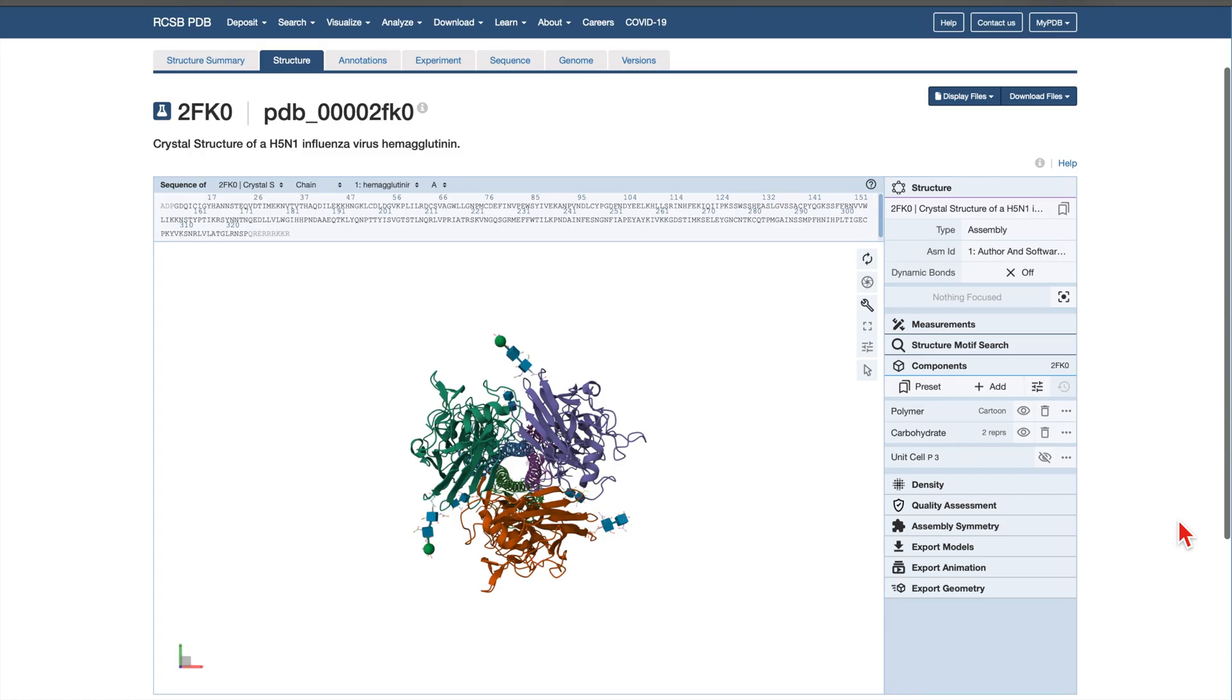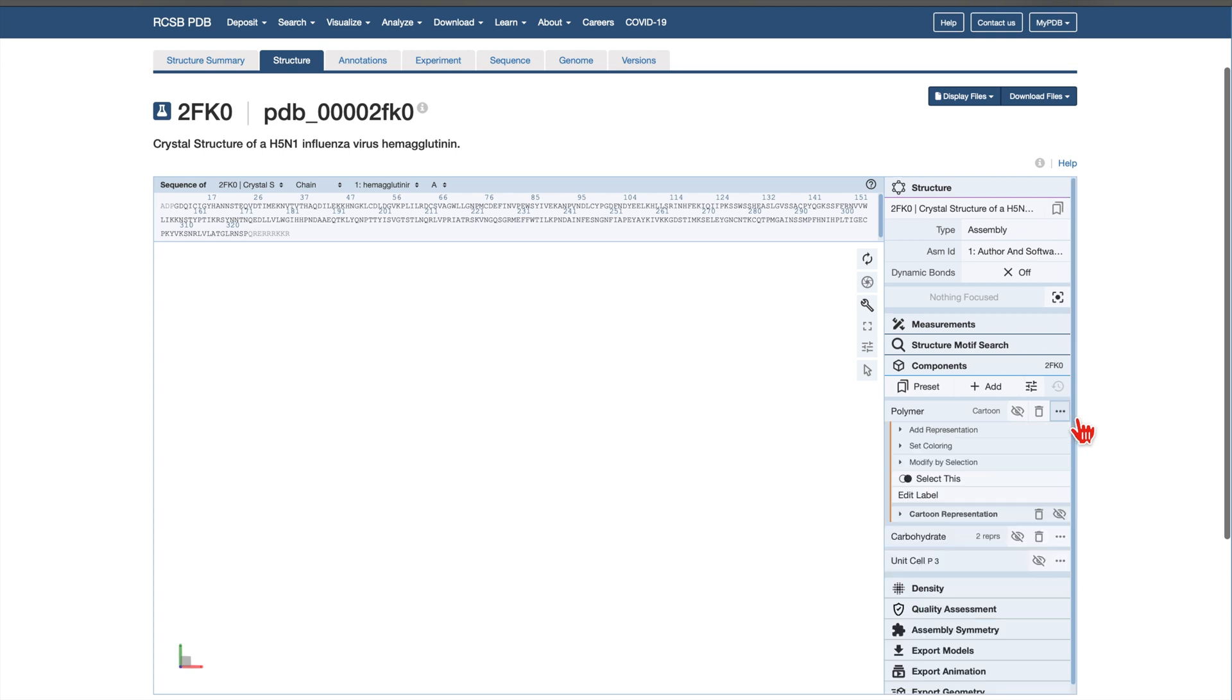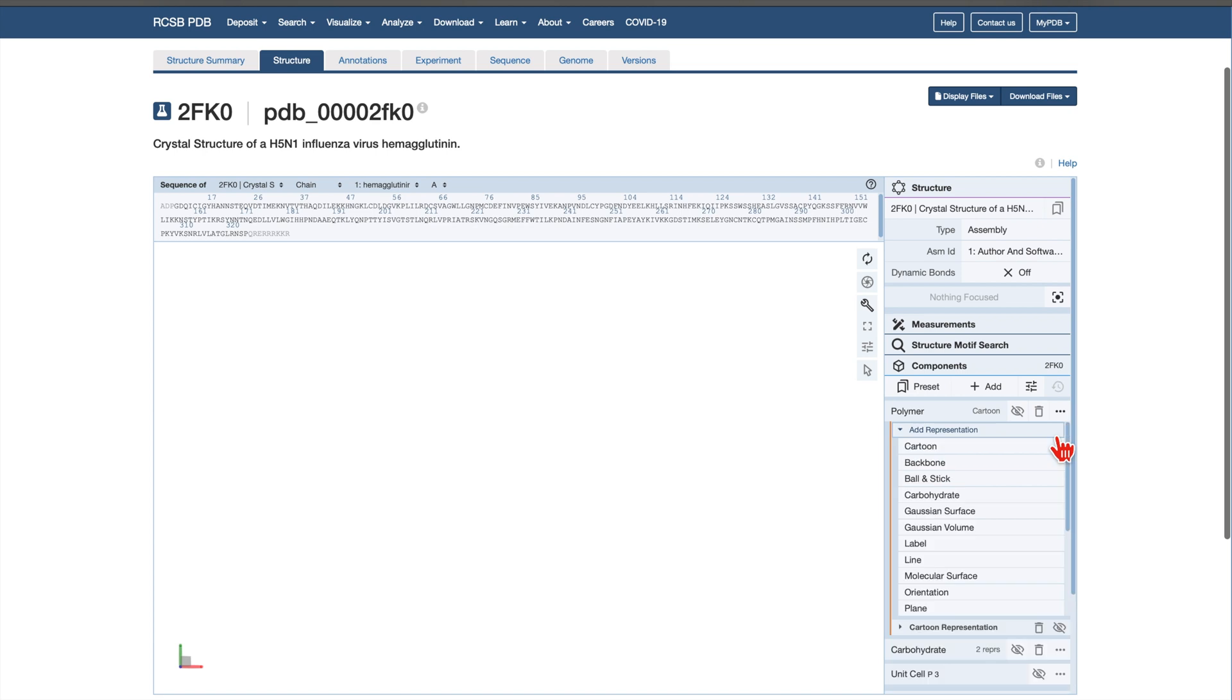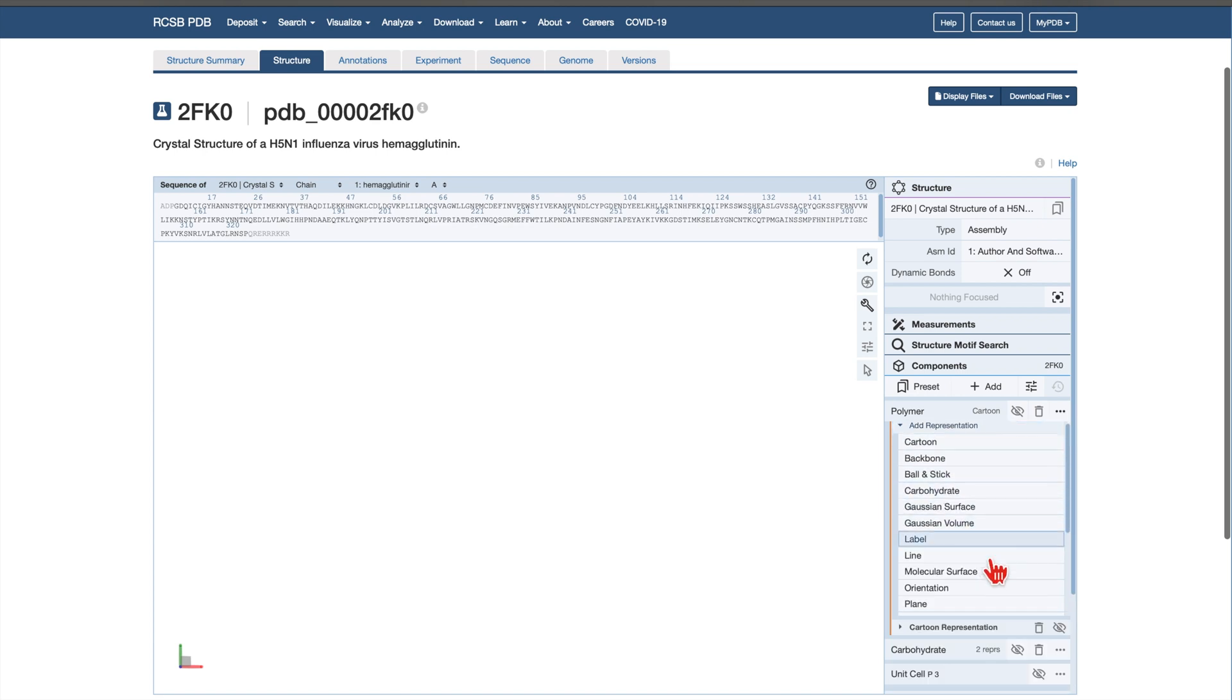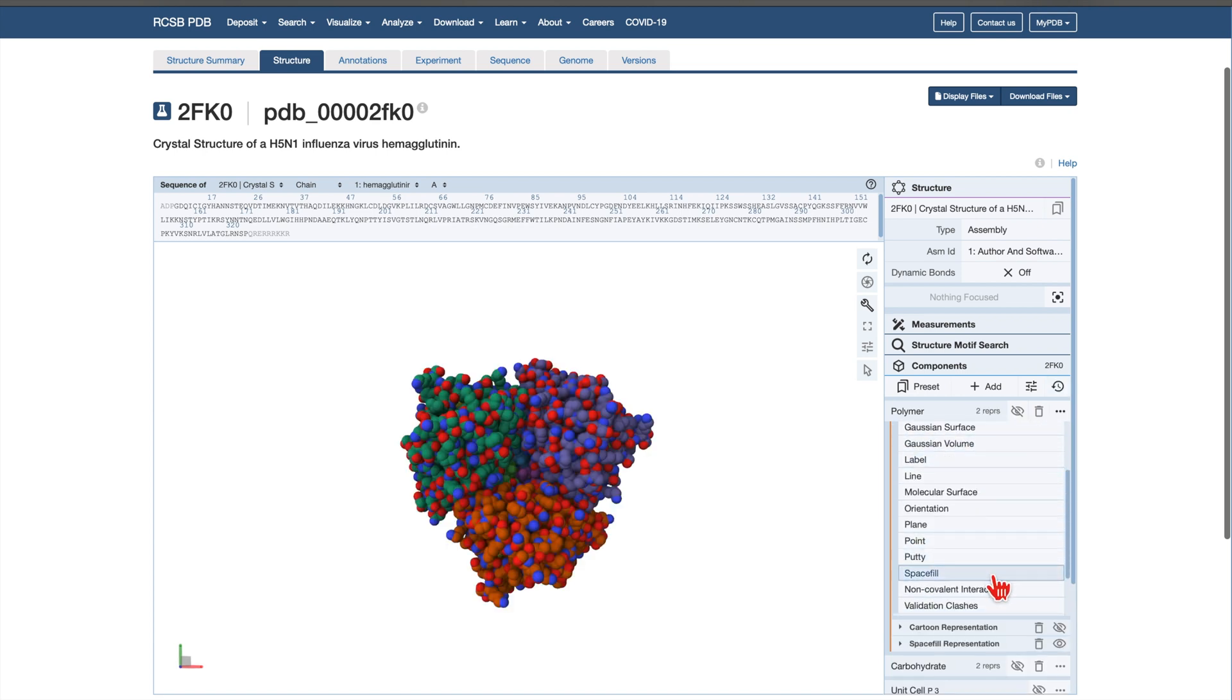Now, let's change how the structure is displayed. Hide existing polymer and carbohydrate components by clicking on the respective eye icons. Next, click the three-dot icon beside the Polymer component to access more options. Choose Add Representation, scroll down, and select Space Fill. This will render all atoms in the structure as spheres, giving a more complete and tangible view of the molecule.